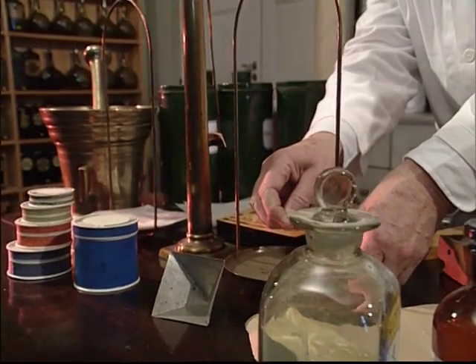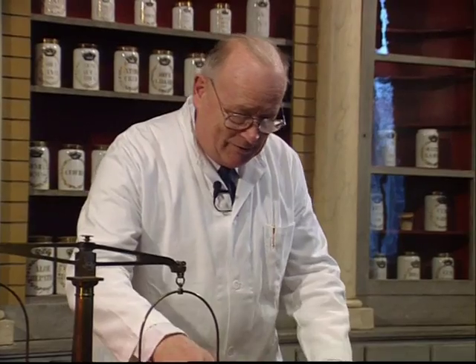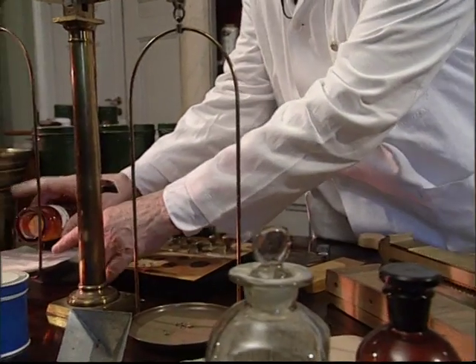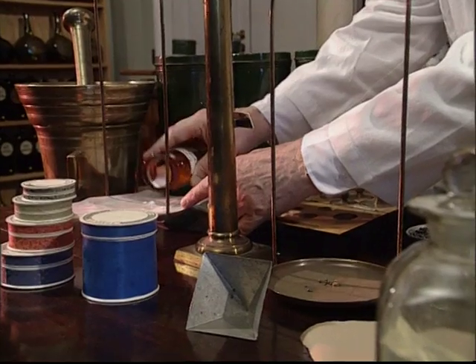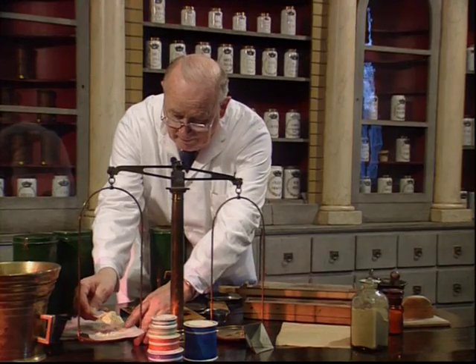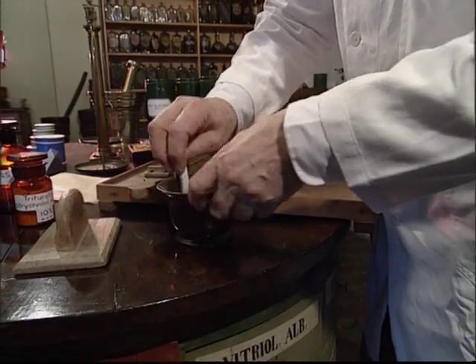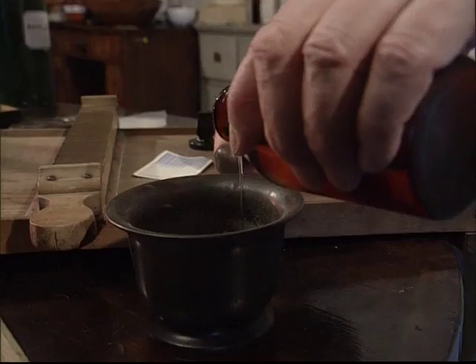Mr. Simonson will make 100 pills of strychnine. These were used if you needed a little strength. Firstly, he weighs the ground strychnine powder. And then althea root and licorice root. And finally, he adds the liquid medium.